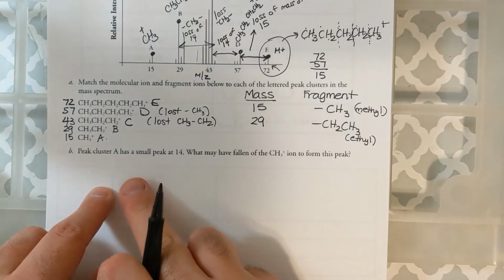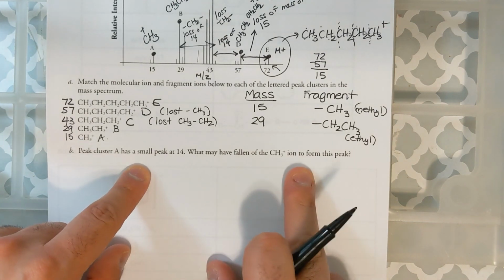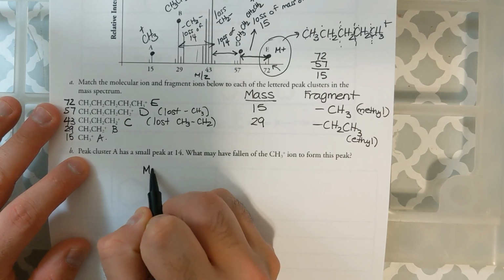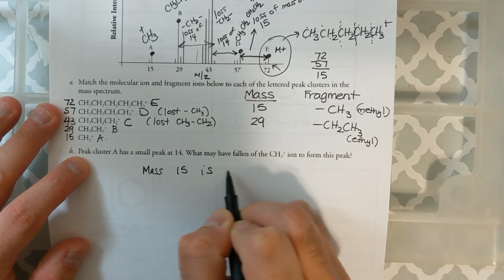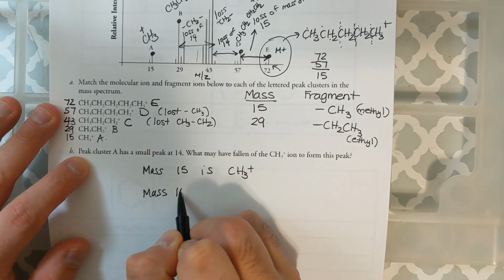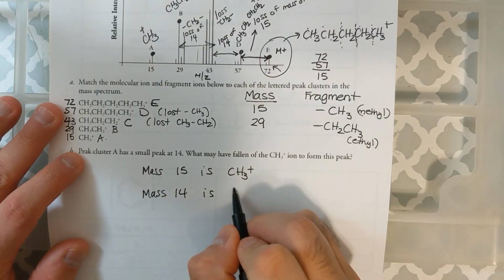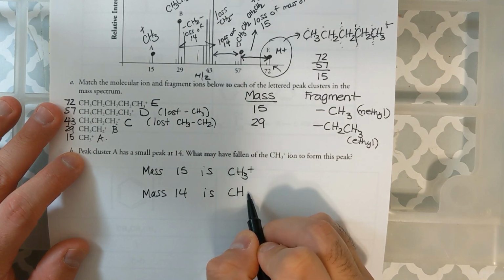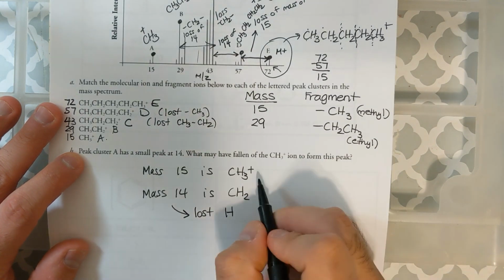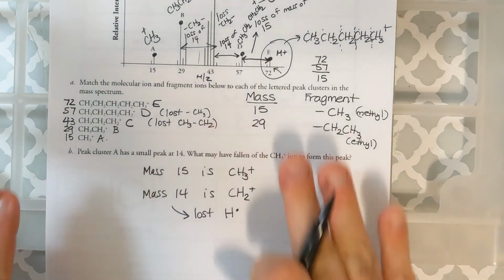And then finally it says peak A has a small peak at 14. What may have fallen off of the CH3 ion to form this peak? Well, we said the mass of 15 is CH3 plus. What would give me a mass of 14 then? Well, the only way to go from 15 to 14 is by losing a hydrogen. So I must have lost an H plus, or lost H. So I'm going to say this is plus, and there we go. I must have lost an H. That's just something to keep in mind of masses.